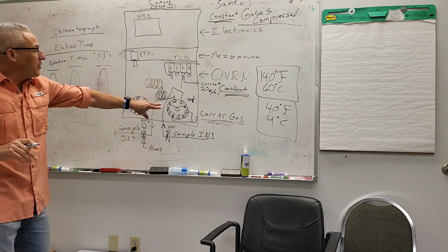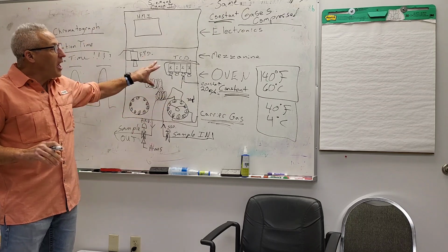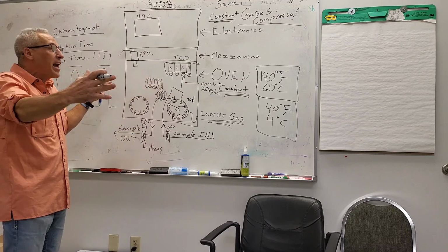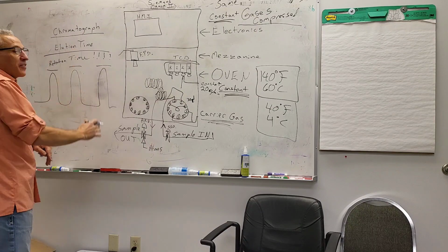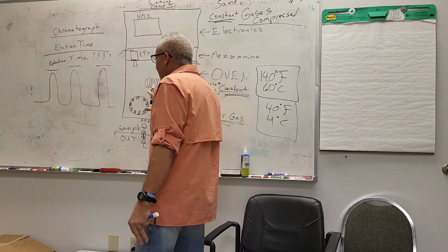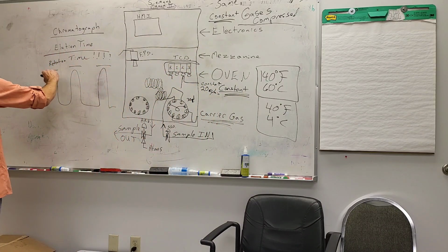We're going to have the same size sample, same flow rate, constant oven temperature, pushing everybody through these columns, which is separating out the components where they elute, and they will show up at the exact same time every time. And we're using this bottle to calibrate this, so it's going to give us the area of these peaks.